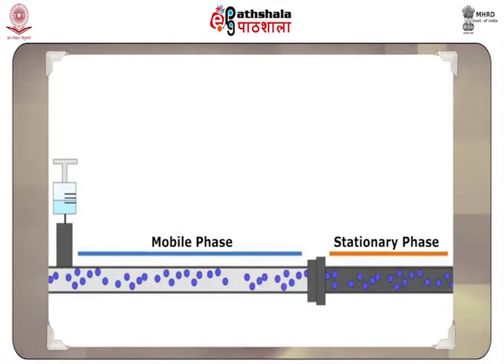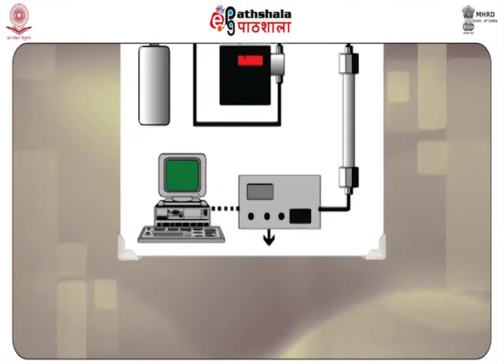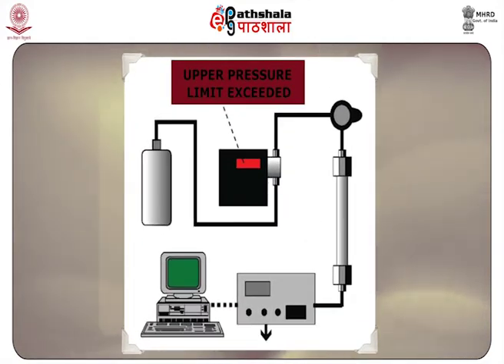Its temperature and composition are the chief influencing factors of this technique. HPLC has marked differences from its traditional low pressure version, as here operational pressures are markedly higher, that is 50 to 350 bar, contrary to this traditional version, which was totally dependent on the gravitational pull for the movement of solvent through the column.